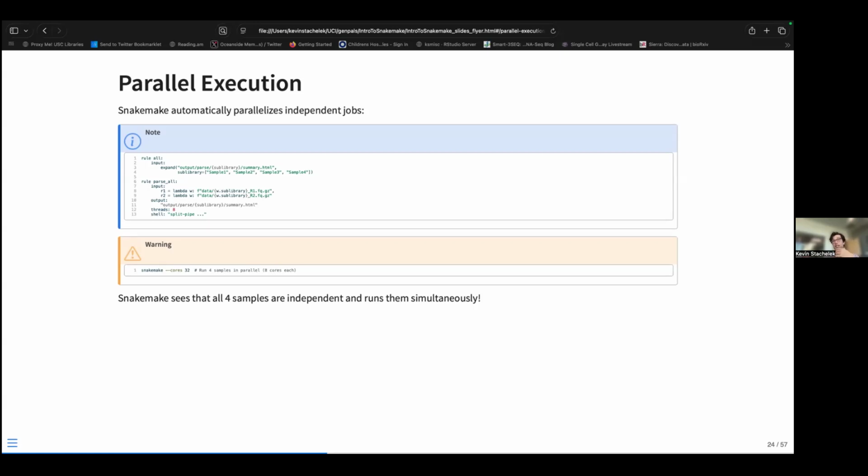And then steps that need to be run all together, for example, in this Parse single cell sequencing situation, it's necessary to individually process particular sublibraries of your data and then process all together once you've generated all of those outputs. So it's fairly simple to construct that kind of logic within the workflow that would be much more challenging to keep track of manually.